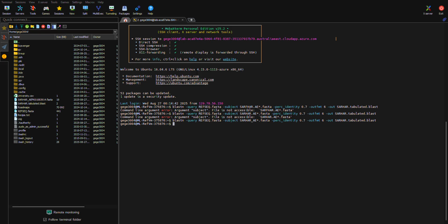How many of you have seen that straight up and down line before? Have you ever used it? How many know where it's at on their keyboards? Yeah. Okay. All right. So that's going to be the pipe. Okay. So what is actually happening here is the command you're telling it is cat. We want to cat your output file, but instead of printing it to screen, we want to pipe that output into the next command, which we should know already is a sort.